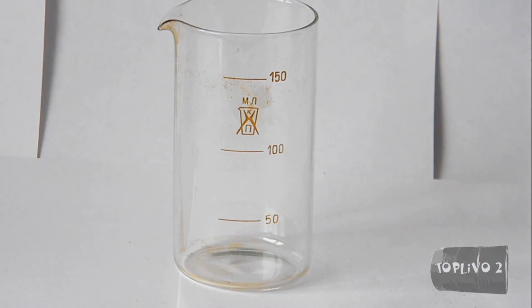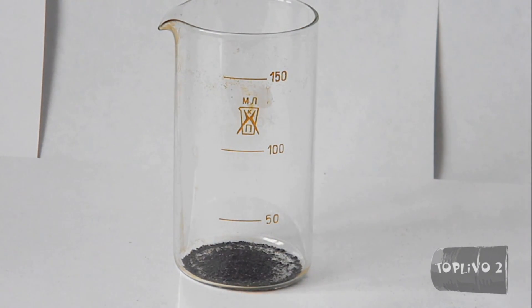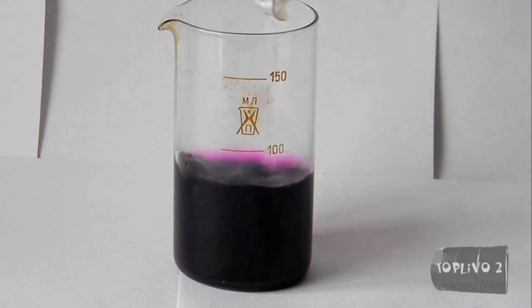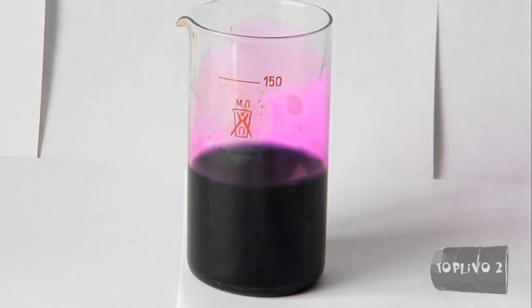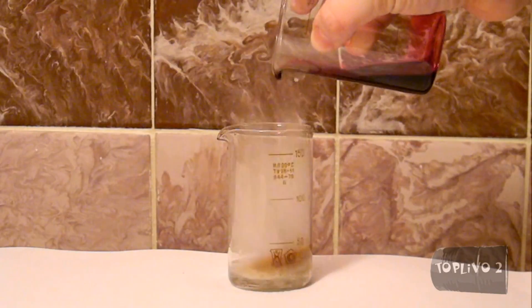Now let's make a solution of potassium permanganate. Take about a half of a teaspoon of potassium permanganate and dissolve it in approximately 15 ml of water. Stir until our crystals have been dissolved. And here we have our second catalyst.